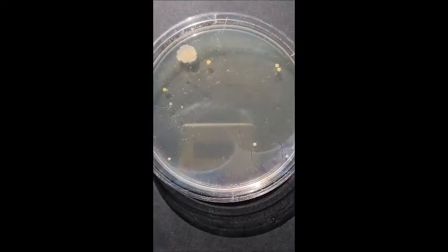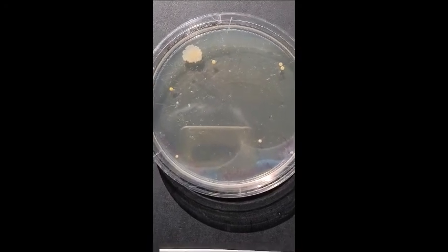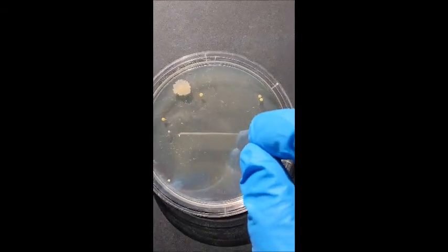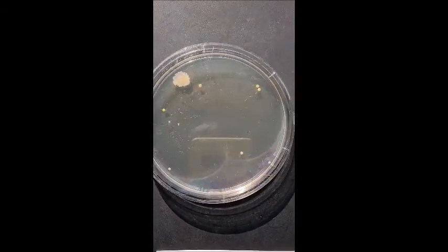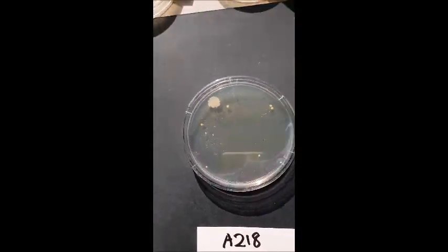Could be a fungus, but I actually think that's a bacteria. I've seen them before, and when they grow even bigger, they grow like into volcanoes. It's really gross. So that's pretty cool. We've got quite a variety on the keyboard.